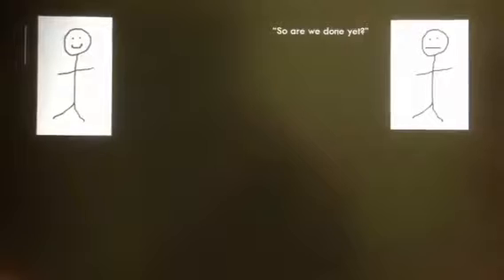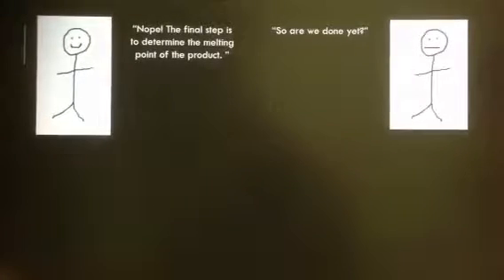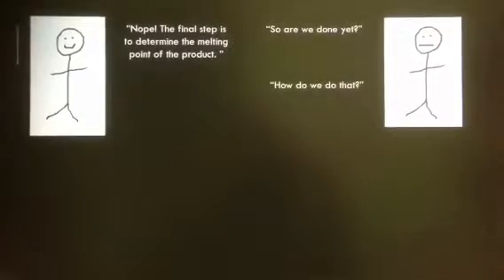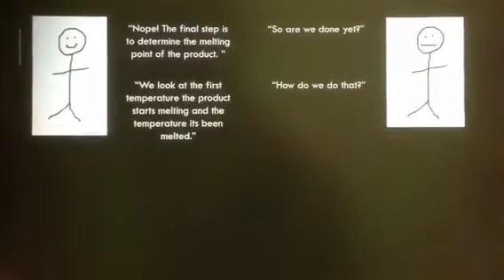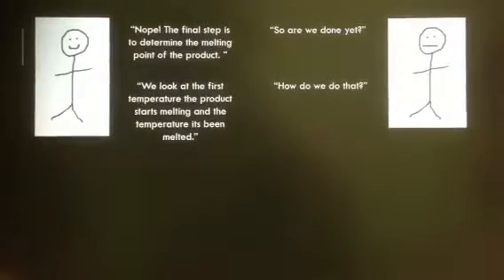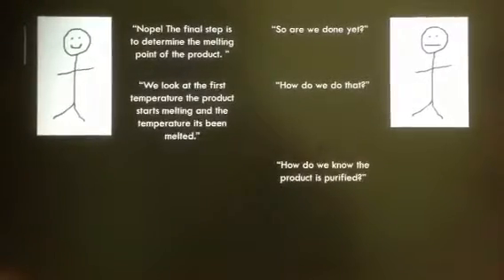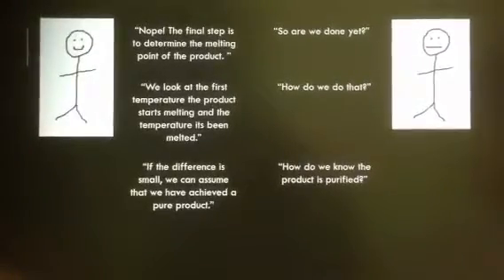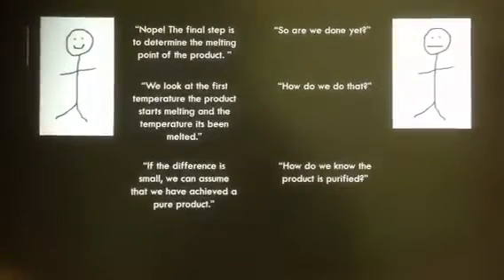So are we done yet? No! The final step is to determine the melting point of the product. How do we do that? We look at the temperature at which the product starts melting and the temperature at which it has fully melted. How do we know the product is purified? If the difference is small, we can assume that we have achieved a pure product.